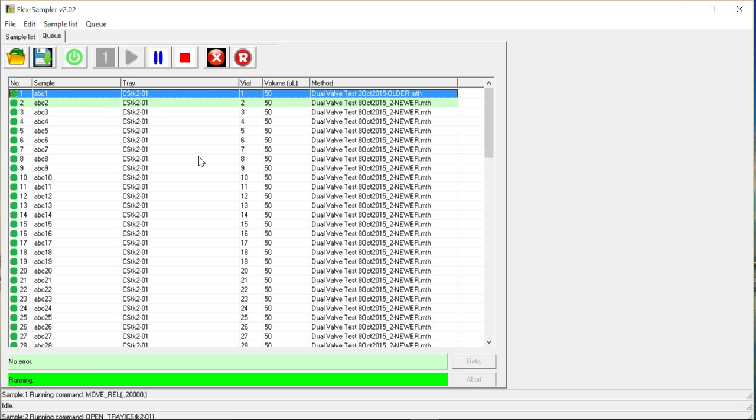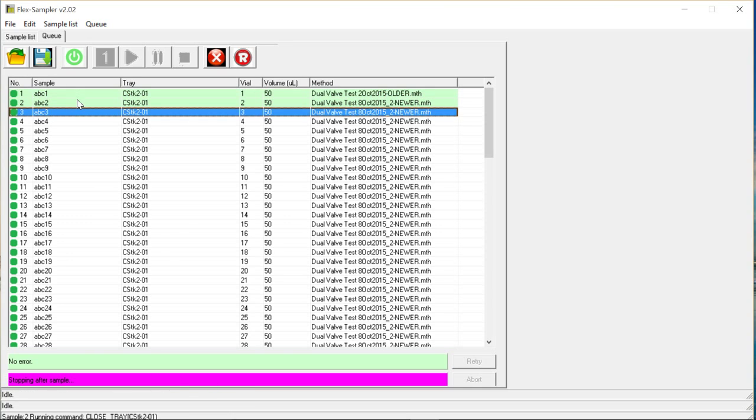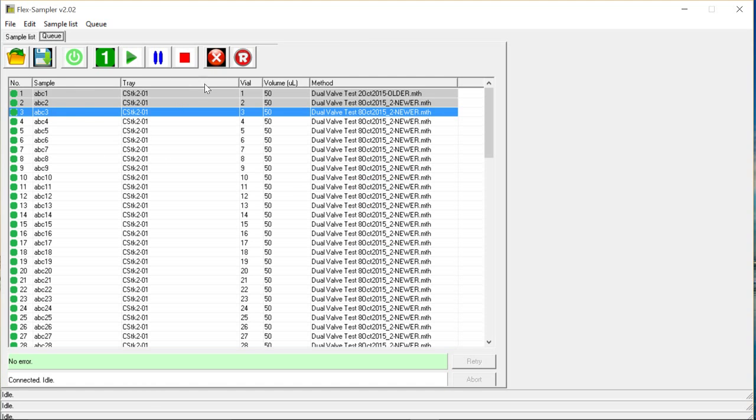And this time we're going to show the stop function. And we just see it stopping after sample message screen. And these will eventually become gray as soon as the automatic drawer opener stops here. Okay, we become gray and we get a message that it's done. So now you can continue to do what you need to do.